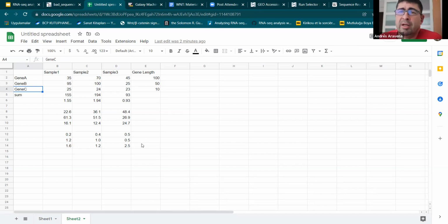The longer the gene, the longer the messenger, and therefore the higher the probability that we read it. The point is that the sequencing, the library production, the thing that we sequence, is a sampling. It's a random sample. And there is all the theory that says that the samples we get are random, but not completely independent of the original data.